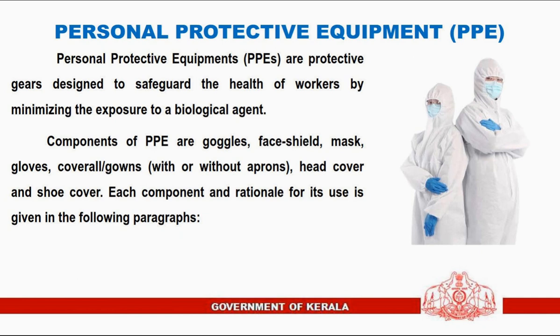Components of PPE are goggles, face shield, mask, gloves, coverall or gowns, with or without aprons, head cover and shoe cover. Each component and rationale for its use is given in the following visuals.